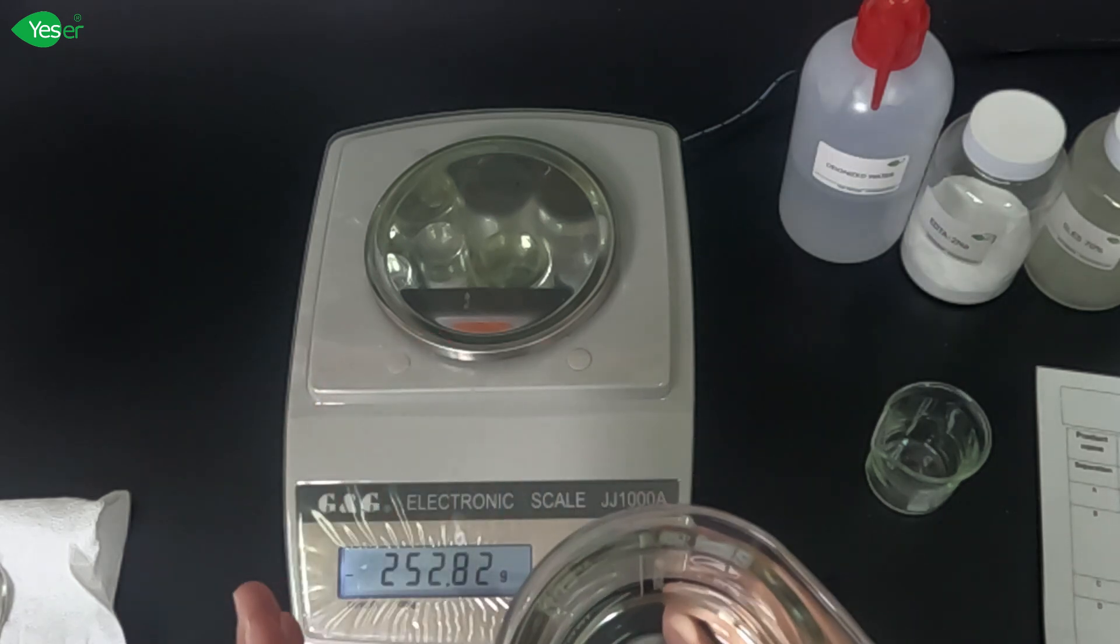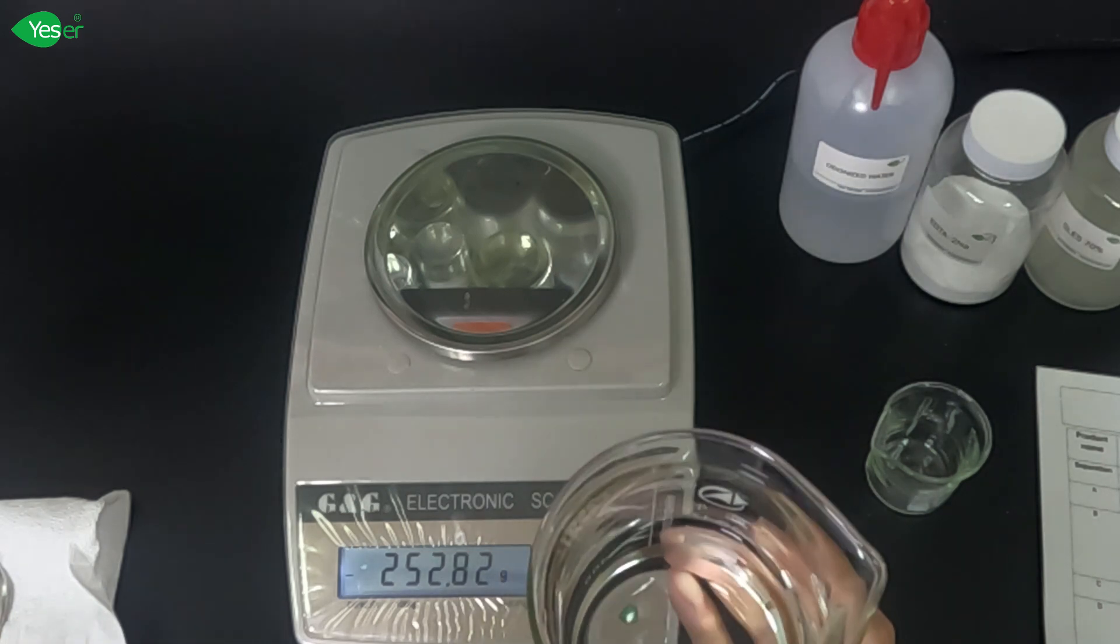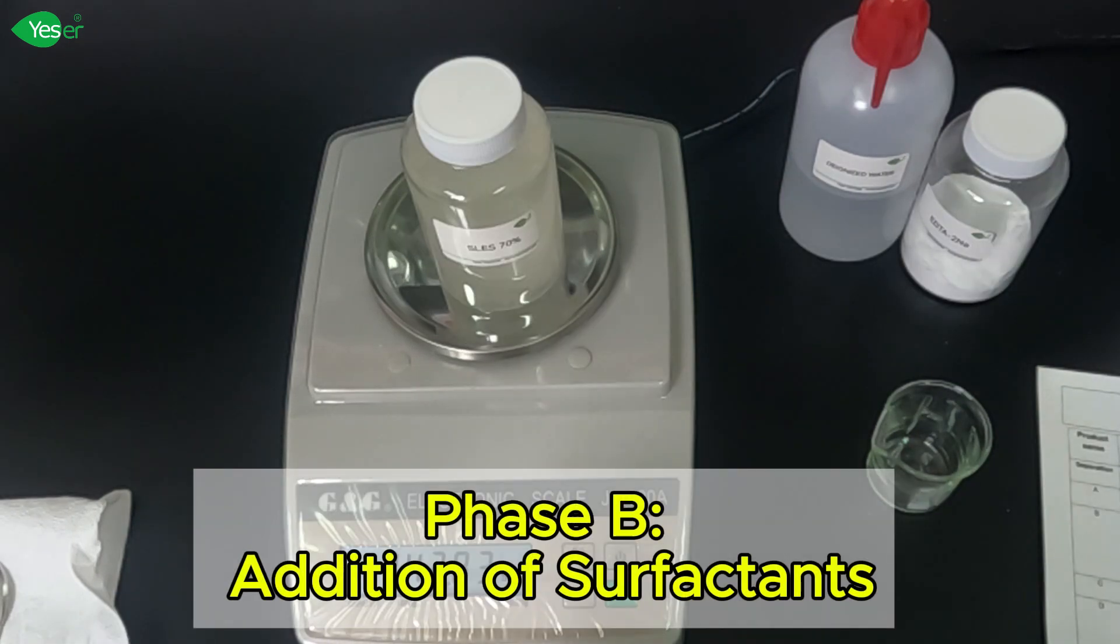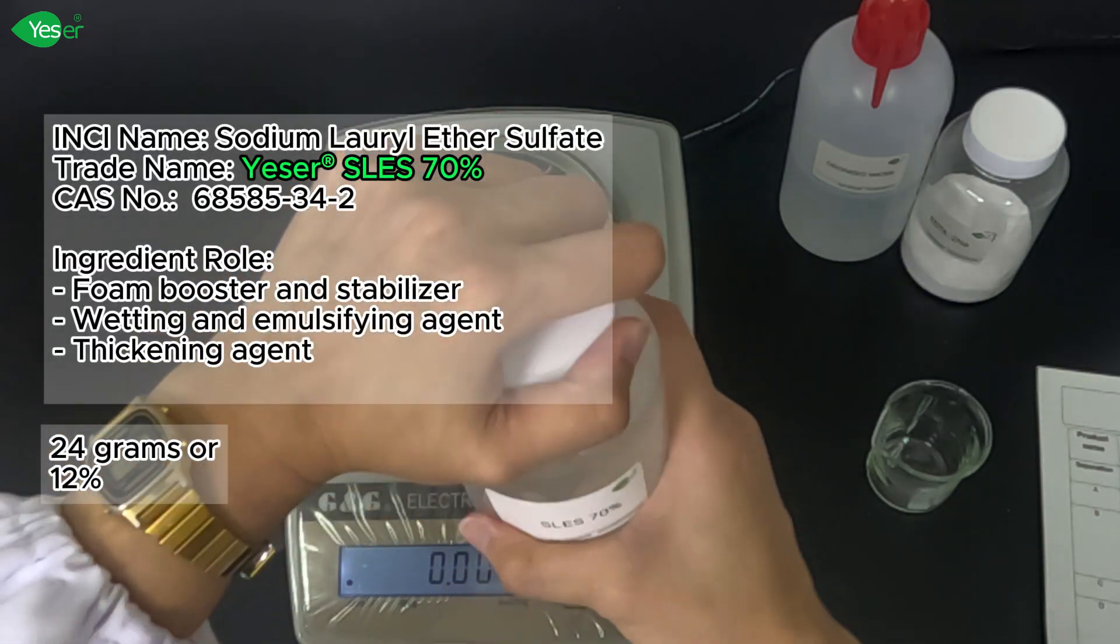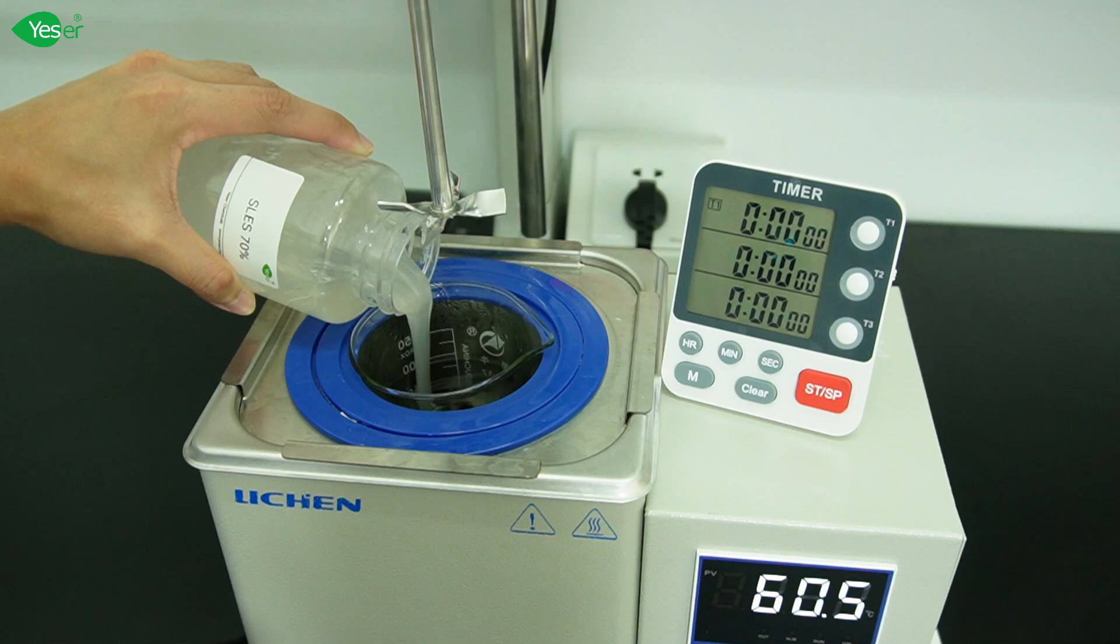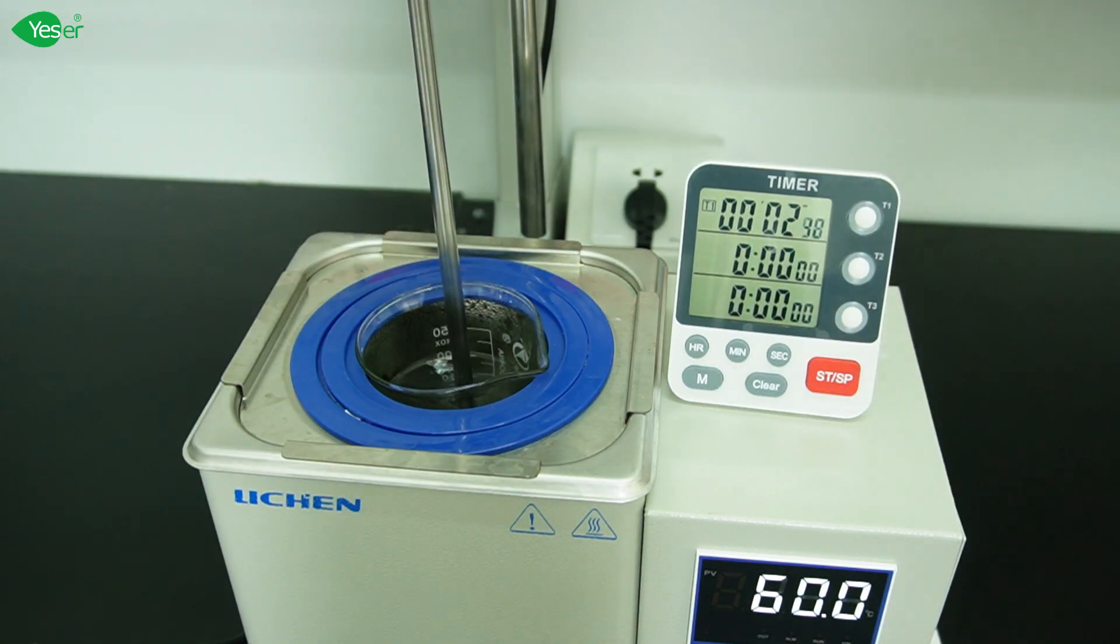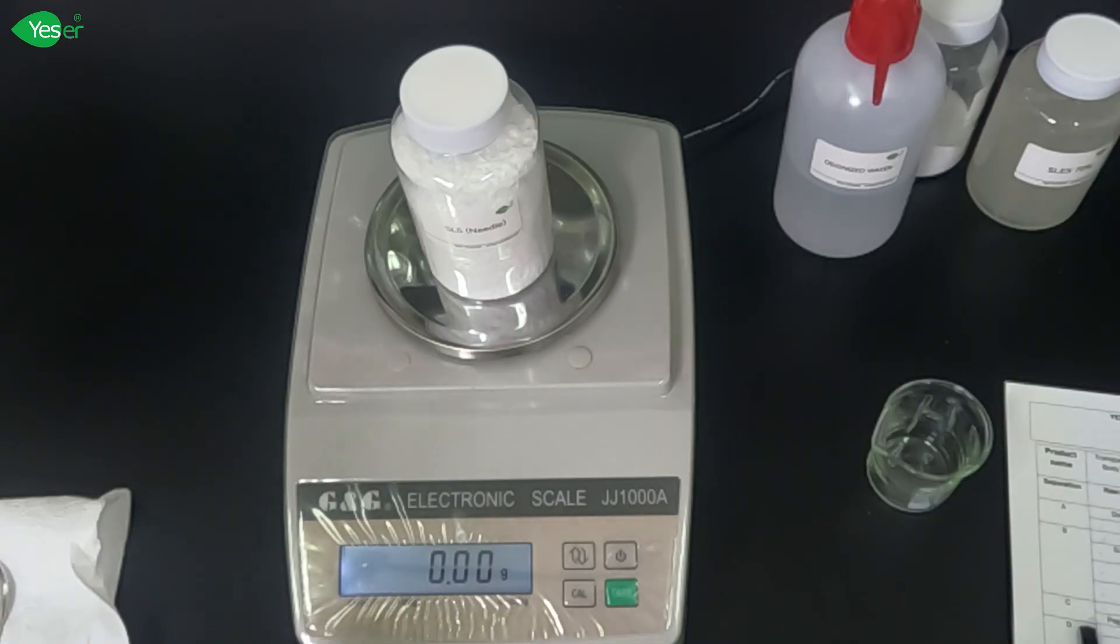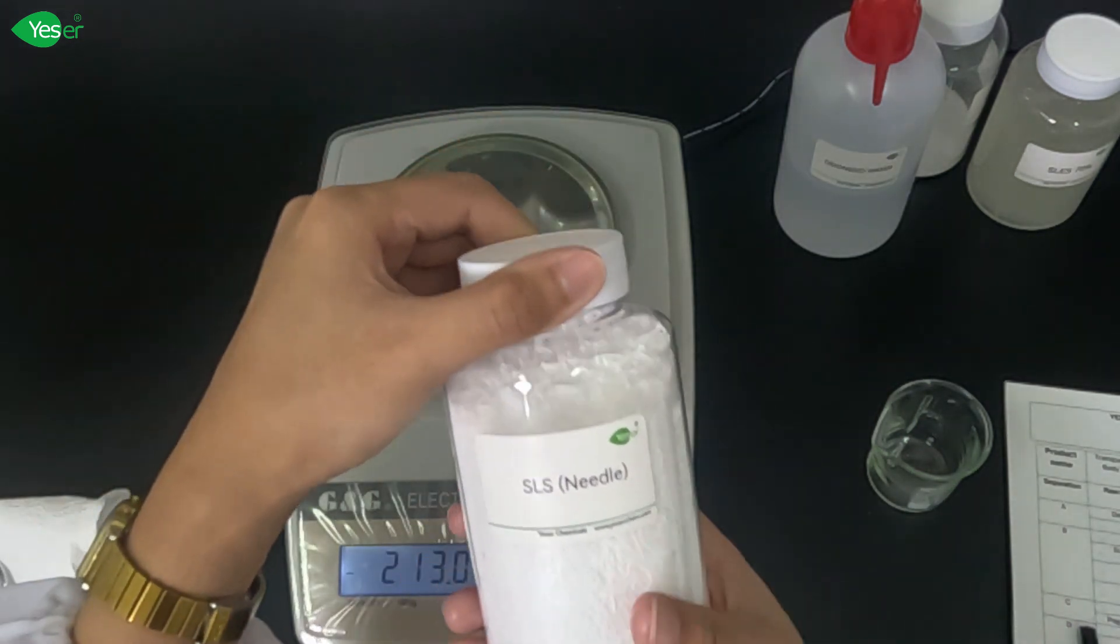Then we will add our SLES, SLS, CAB 35%, and our CDEA sequentially until all surfactants have been fully dissolved in the solution. Let's weigh about 24 grams of our SLES 70%, or 12% for this formula.